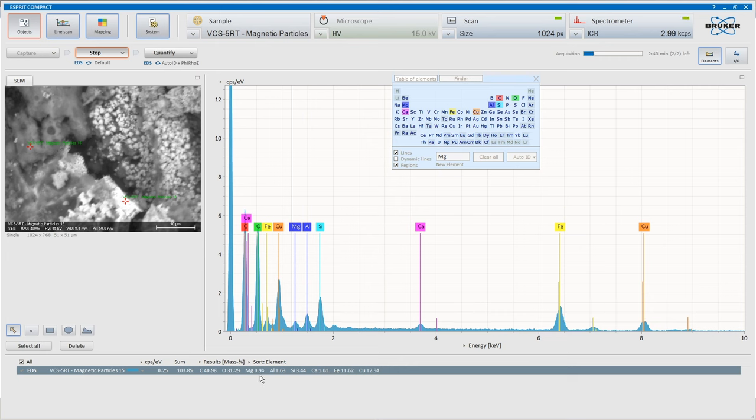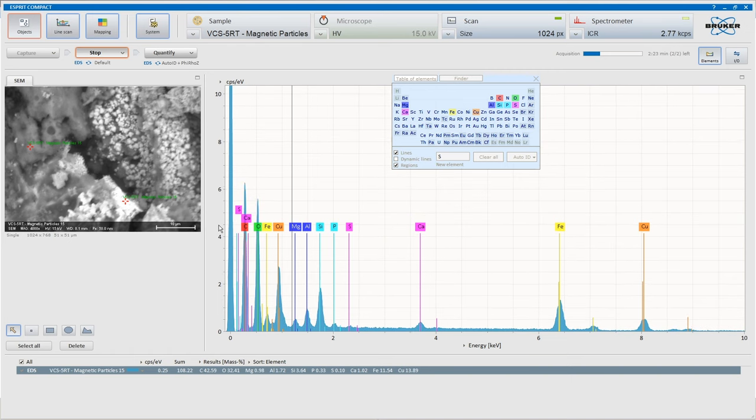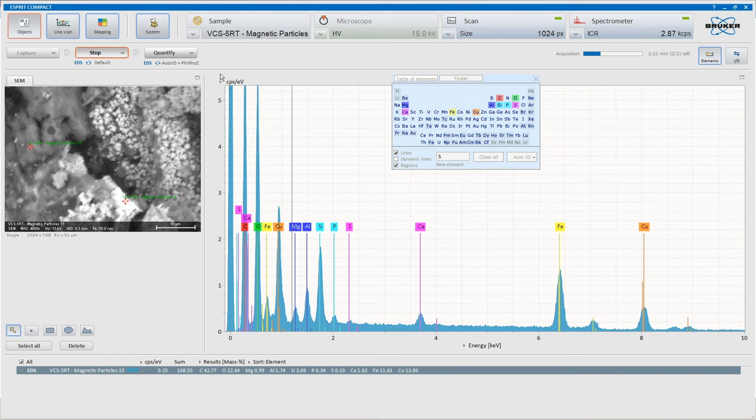Just under the 1%, so it doesn't pick it up. Just under. And is that phosphorus? Yes, phosphorus here. Again, the phosphorus is under 1%, but the signal's there, and it also looks like it's got sulfur there, but again it's not a very big signal. So this looks like it's the synthesized material.